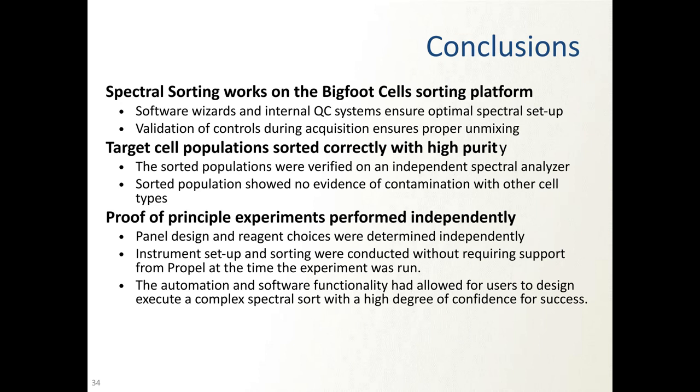Scratch that. Proof of principle experiments were performed independently. Panel design and reagent choices were determined independently. The instrument setups were just done by us. I basically sat with one of my sort operators and the postdoc, and we did it. We didn't have an army of support people and applications people holding our hands to do it. It was done by us.